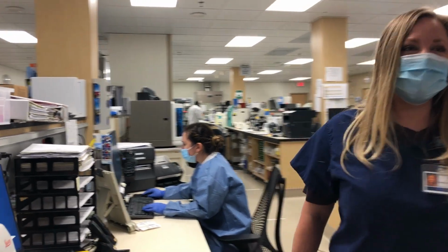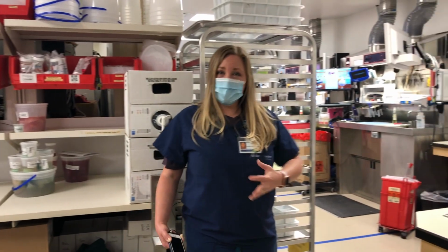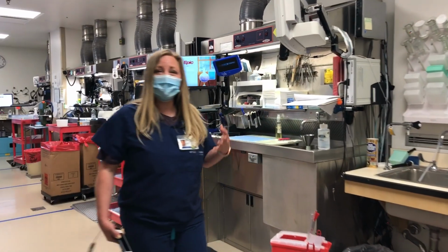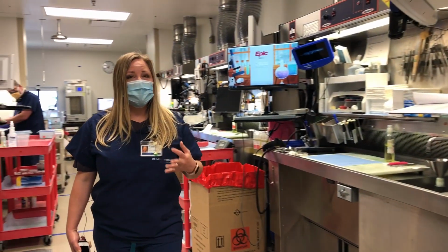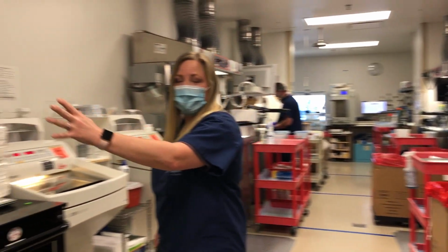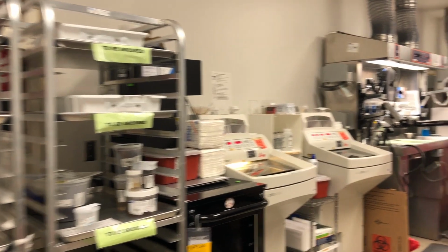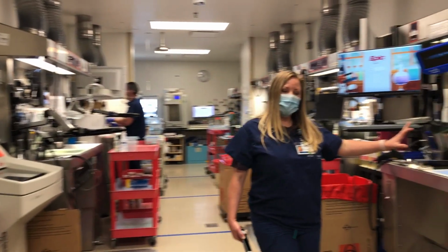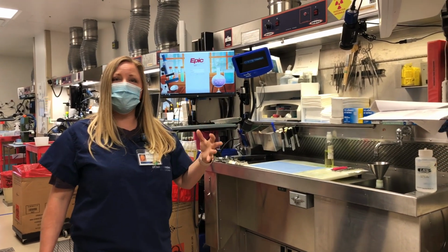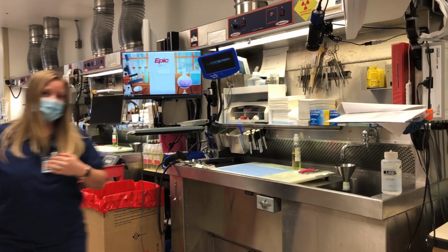And then once that tissue comes into the lab, we want to actually take it from something very large to something very small. So in this area, this is actually where dissection happens. We have PAs and residents that come in to do that dissection of tissues. Those tissues are ready to be grossed after they have sat in formalin for a little while, and they will come in here. We have multiple different bays or stations, and this is like our desk workspace where we get everything dissected from a very large specimen down to a very small specimen that will be put on the slides. So we'll walk through and we'll show you that.